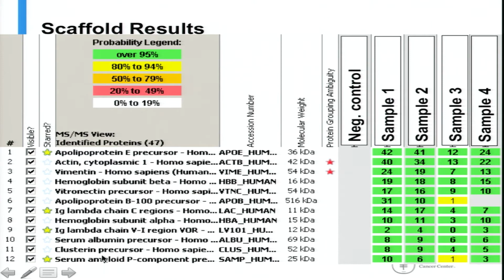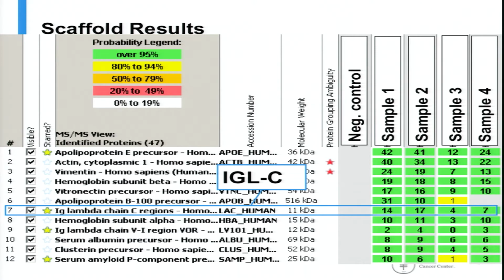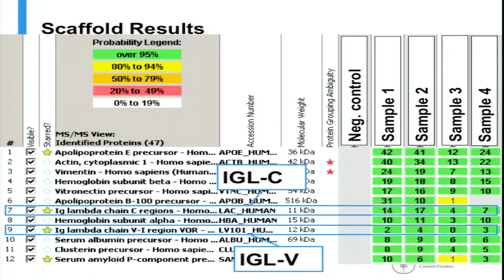And these are the list of proteins we have identified in that glomerulus. First of all, there are a couple of proteins that are well described to be present in every amyloid. These are possibly the chaperones that lead to abnormal folding, ApoE and SAP. Next we are seeing immunoglobulin lambda constant region, and that tells us that this is AL lambda amyloidosis. Additionally, we have a variable region, which is unique to the patient, unique to the plasma cell clone, so that is clonal amyloid. So that tells us that not only do we have lambda, but it's a clonal lambda light chain. Further down here, you see, for example, clusterin, a common component. It's a well-recognized chaperone, possibly involved in amyloidogenesis. So there is other information that's available.